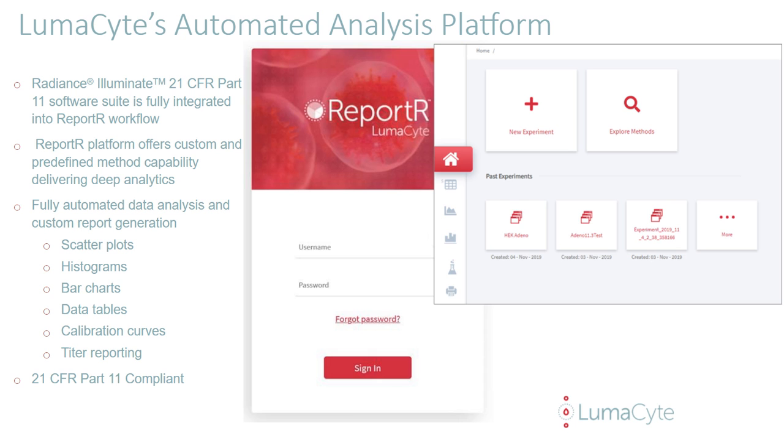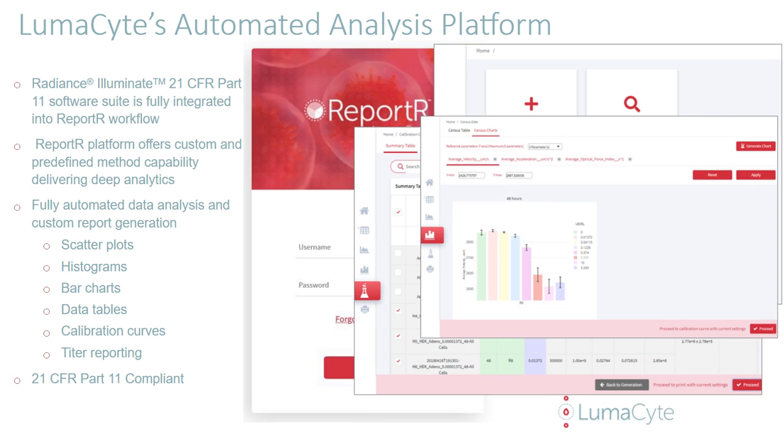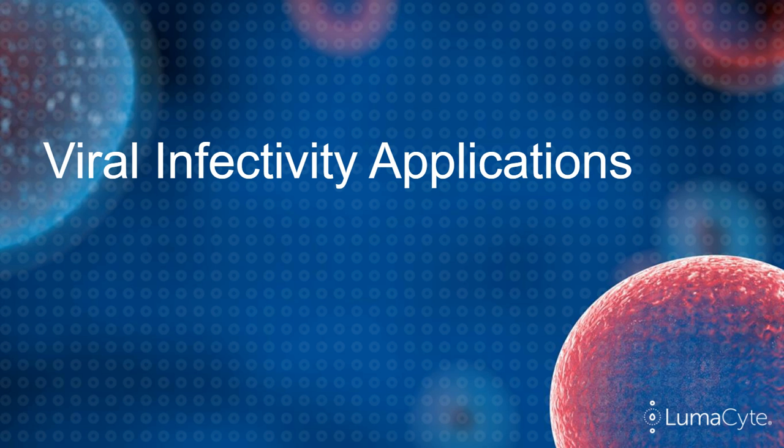And you can develop your calibration curves by looking at data when you're first developing a method. You can look at bar graphs or scatter plots, but this allows you to develop the method, develop your calibration curve, save it, and then use it automatically going forward.